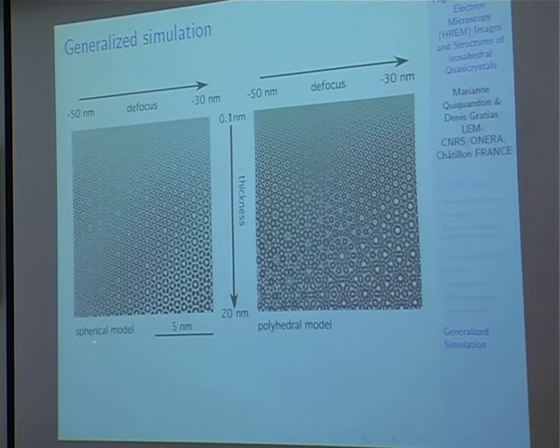The spherical model is the model presented by Buddha et al. in 1992. On the N atomic surface, you have a small sphere of manganese surrounded by a shell of aluminium. The N prime atomic surface is a small sphere of manganese surrounded by a shell of palladium and a larger shell of aluminium. And you have a small sphere of palladium on the BC atomic surface.